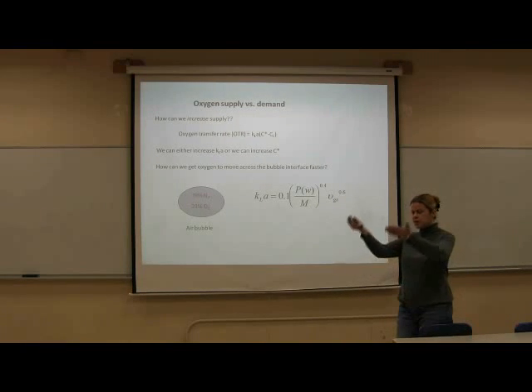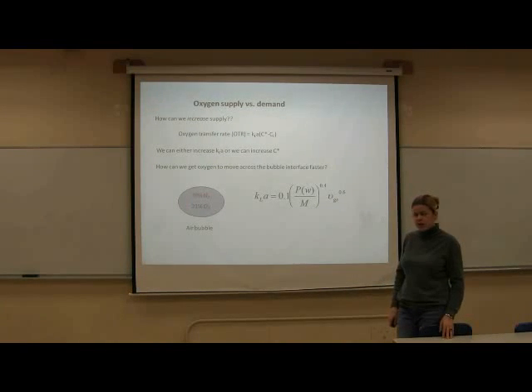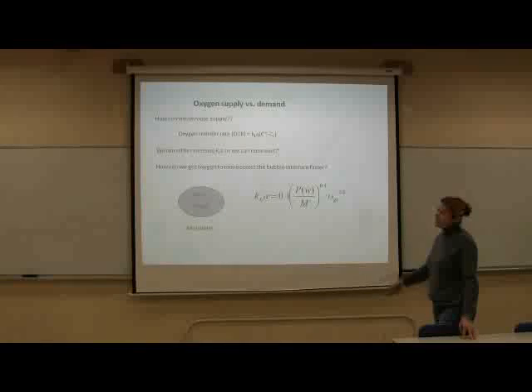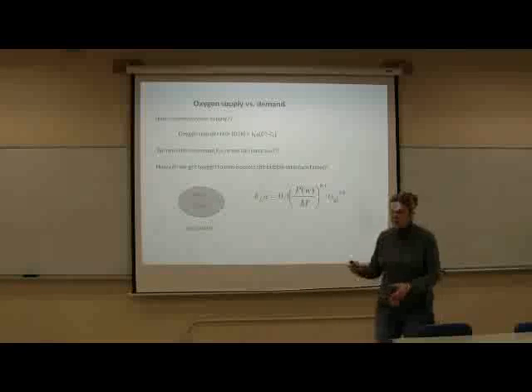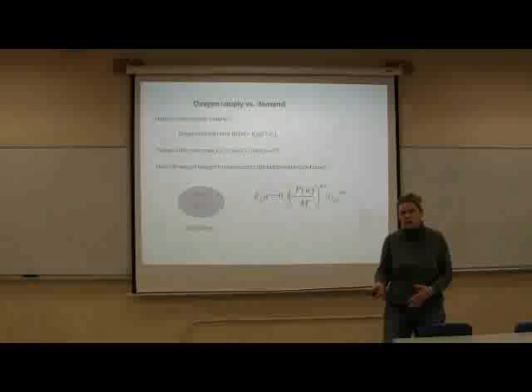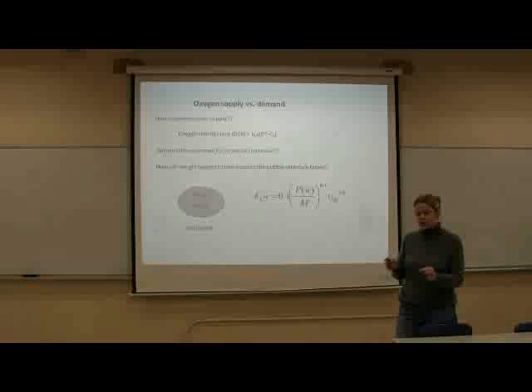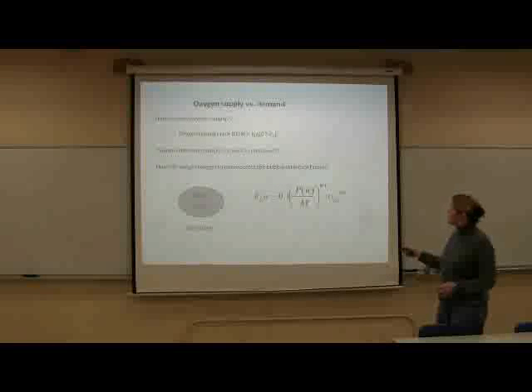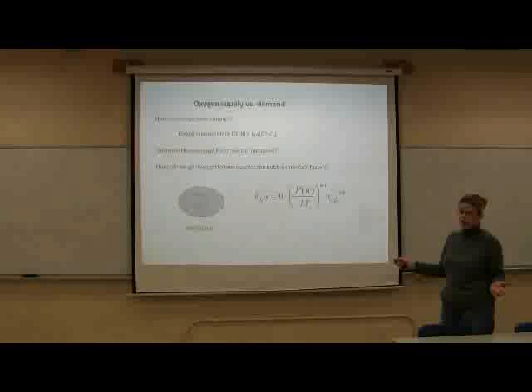You can assume that there's an average value of the superficial velocity of the gas going through. You can determine that. And the power per unit mass is not that easy to measure, because it's not usually monitored on small fermenters; the amount of energy used is small. They usually monitor the torque in the motor, but we don't have our bioreactor set up to do this.